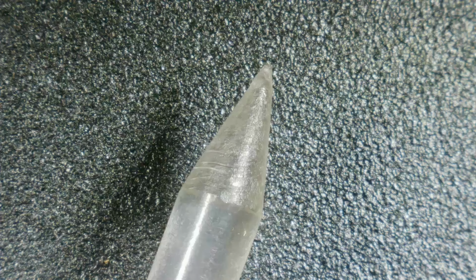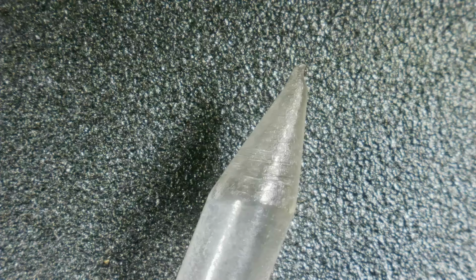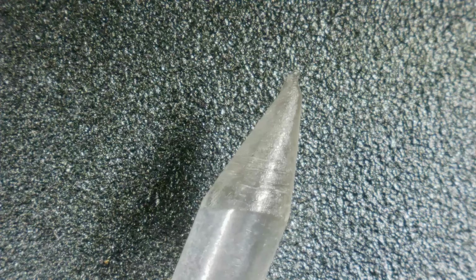That was the 8 there. And then even going down into the copper is quite sharp, sharp enough. Plastic likes to get dull quite quickly. I would not recommend starting with your 2 here. It's gonna be mushed up before you know it. We got a little mushed bit there at the end already.